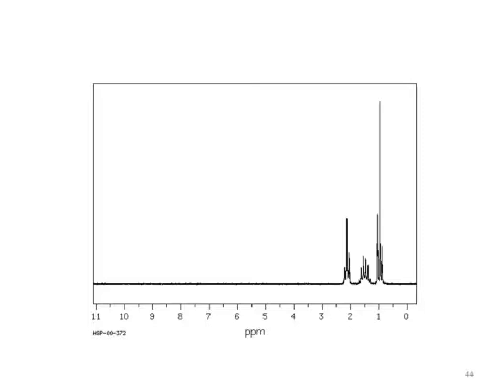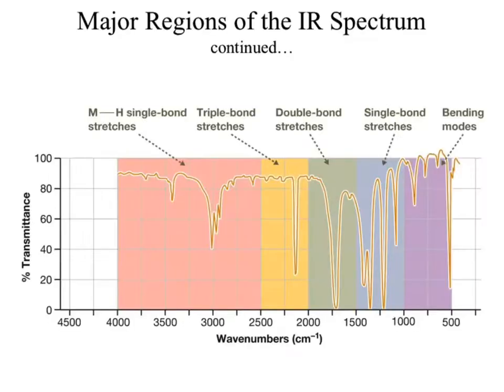So with that, we'll go ahead and hit the next slide. I'm going to pause. IR. Your textbook has a nice little image within IR. We talked about the theory behind it. It's bond vibration. We have bonds that can disappear. We have bonds that can appear stronger because they're more dipoles.